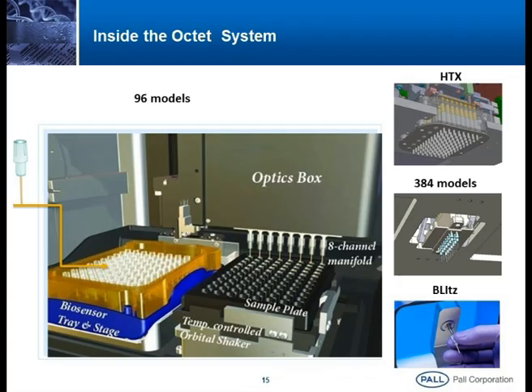So here, as I said, we don't have microfluidic devices. To assist binding, we require a shaker. So the shaker enhances the binding. This shaker we can run from 100 RPM to 1500 RPM depending upon the application. Suppose when can I use what kind of RPM? If I am working with a very high concentration, I can use a low RPM, 400 or 500. If you are working with a very low concentration, then I have to increase the RPM speed. So the shaker will enhance the binding.